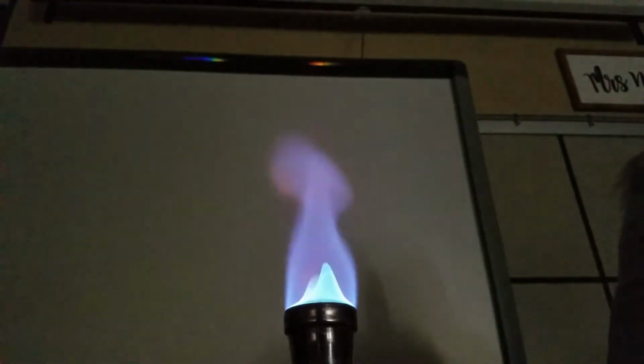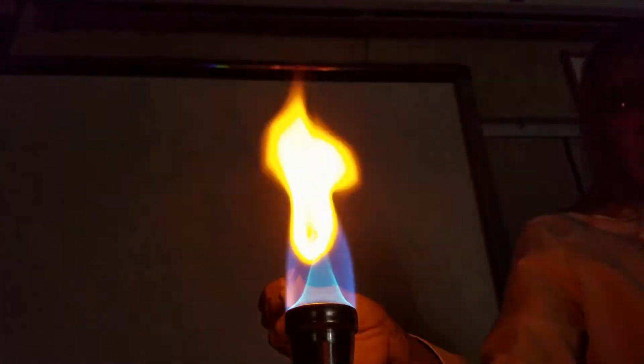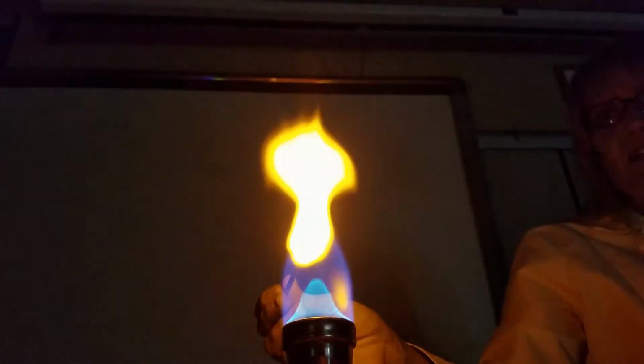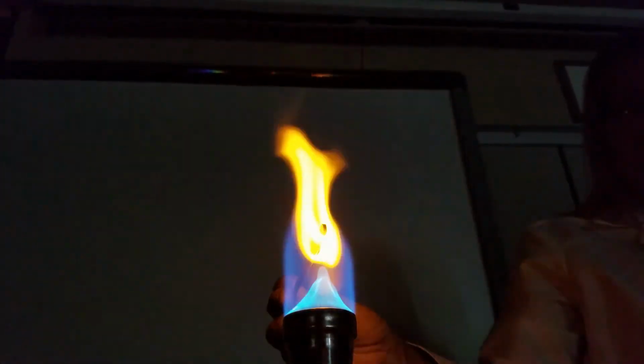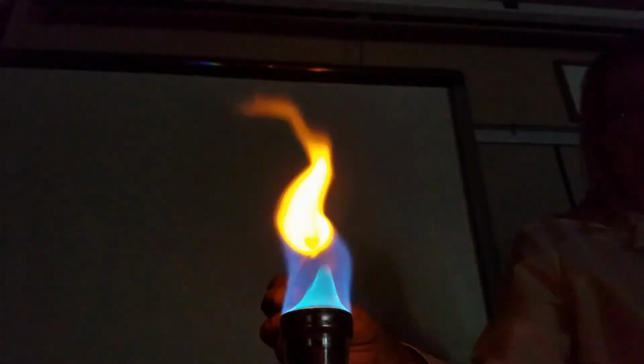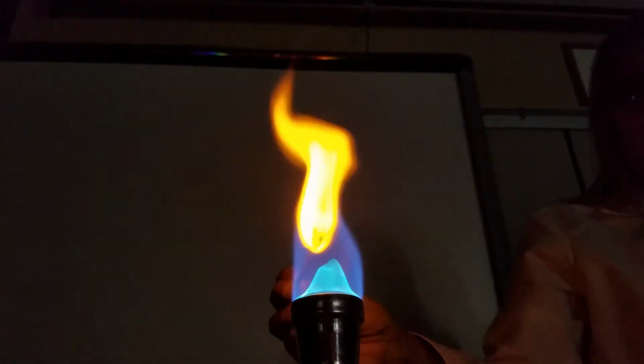Then we have sodium chloride. This is one you could try at home if you wanted and you had parent permission, because sodium chloride is just table salt. So if you soaked a popsicle stick in table salt and held it over a gas stove, that's what you would see from the flame.